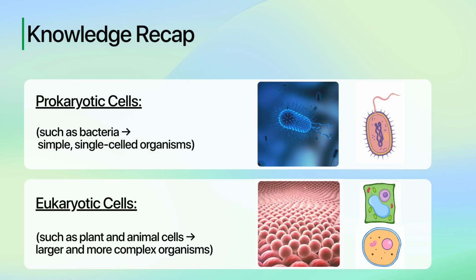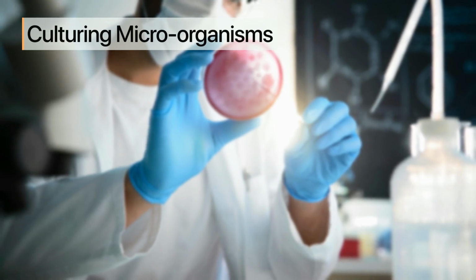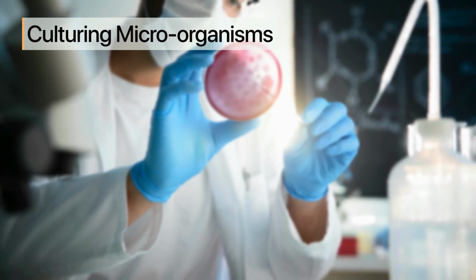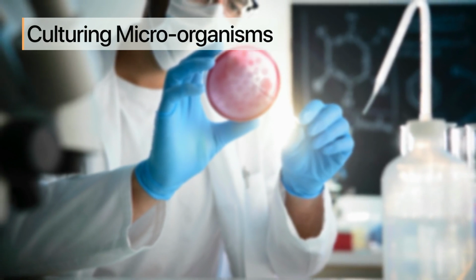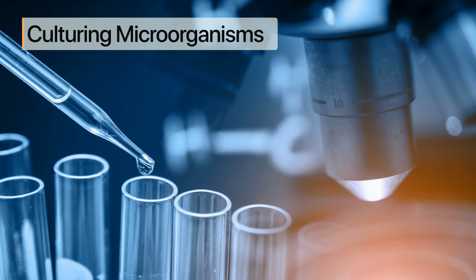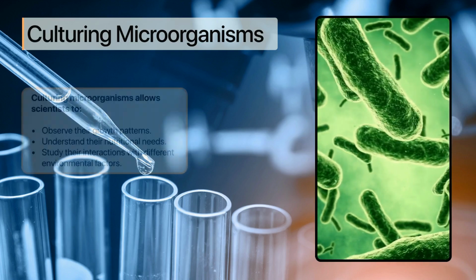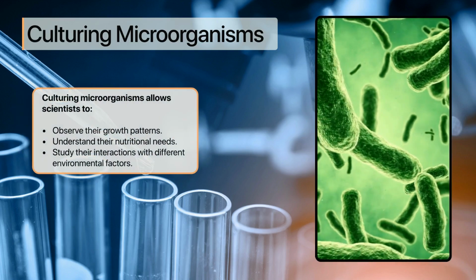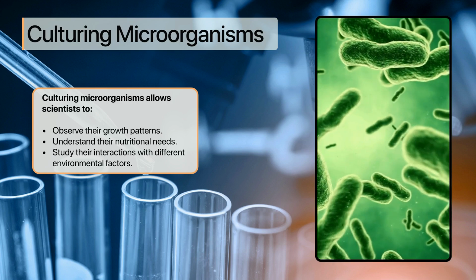Let's get started. Today, we will explore how we study bacteria by growing them in the lab, a process known as culturing. Culturing microorganisms is an essential technique in microbiology that allows scientists to study bacterial evolution, genetics, and responses to various conditions. The concept of culturing microorganisms advances our biological understanding by allowing scientists to observe their growth patterns, understand their nutritional needs, and study their interactions with different environmental factors.